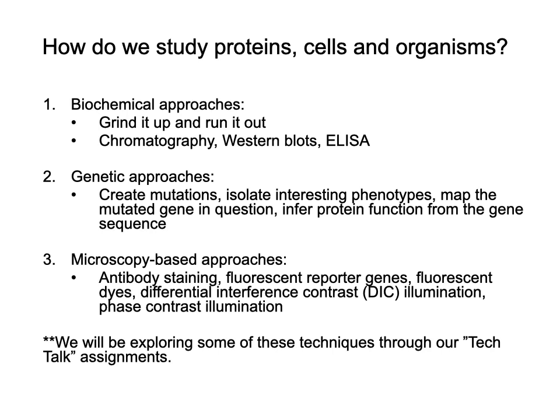So chromatography would be using columns. The Western blot is where we take the proteins, run them out in a gel, and then we transfer it onto a membrane, stain that, or use antibodies to detect specific proteins. And then in ELISA, you're using a dish with multiple wells where we've added antibodies that are specific to certain proteins, and that allows us to detect whether that protein is present or not.